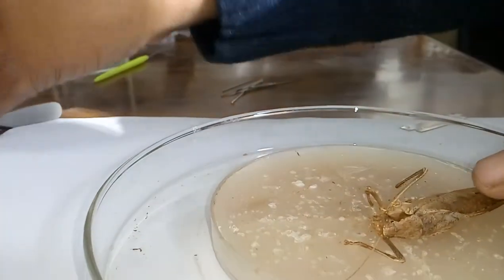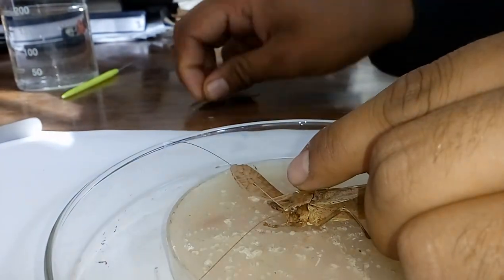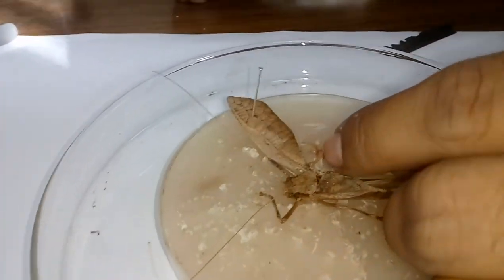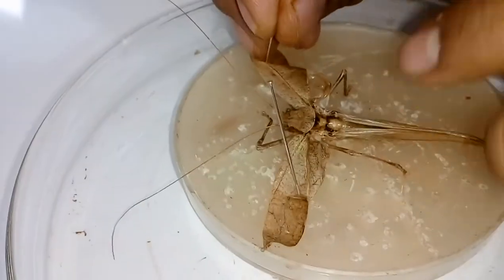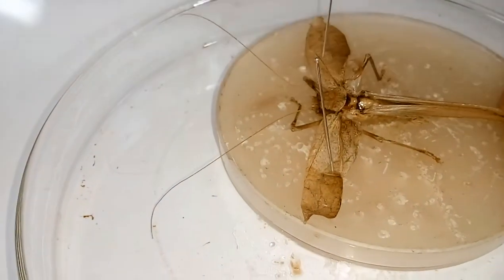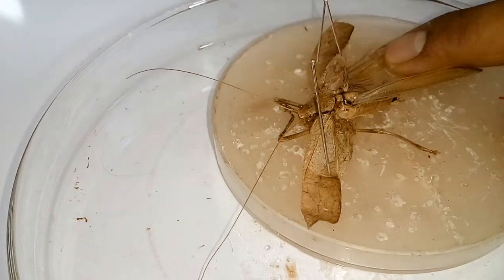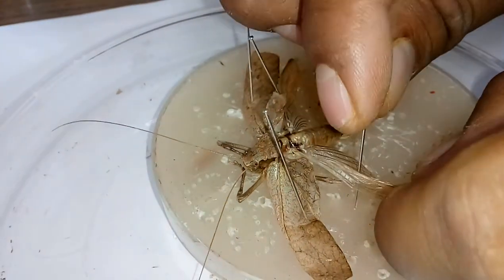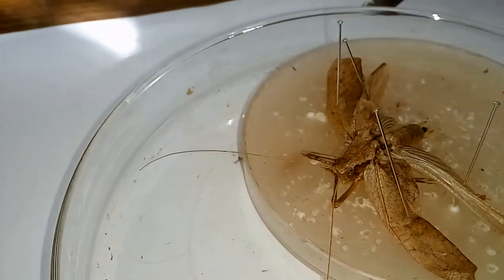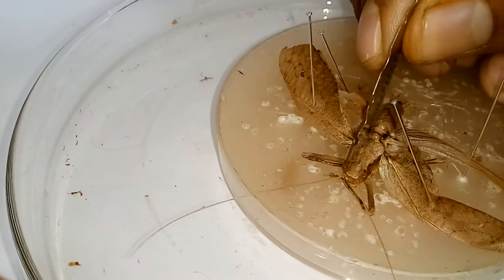Further, you just open up the wings of the grasshopper — both the forewing and hindwing — and using your pins or needles, put pins in the wings so that the specimen will be stable. You have to position it like that, and similarly for the hind wings.